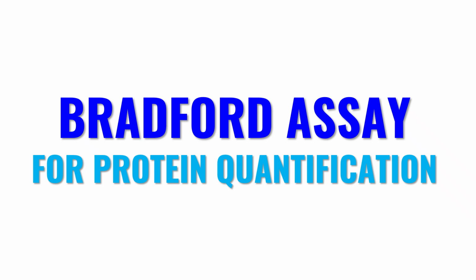This method was published by Bradford in 1976 in a journal called Analytical Biochemistry. It is a highly sensitive and rapid method for the estimation of protein in microgram quantity. I will briefly explain the underlying principles, components, and conditions of the assay. In addition, how to set up the assay and prepare a standard curve using BSA will also be discussed.